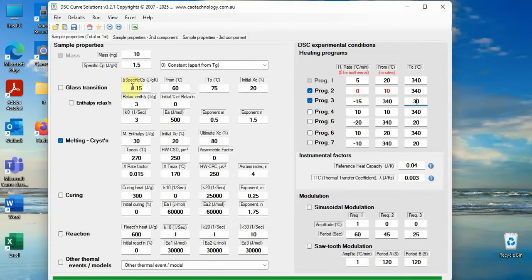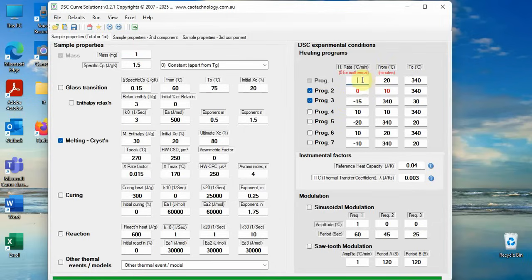First put known parameters, sample mass, heating rates etc. to the boxes. Then put guess numbers relating to the crystallization and melting to the relevant boxes. Run DCS simulation.